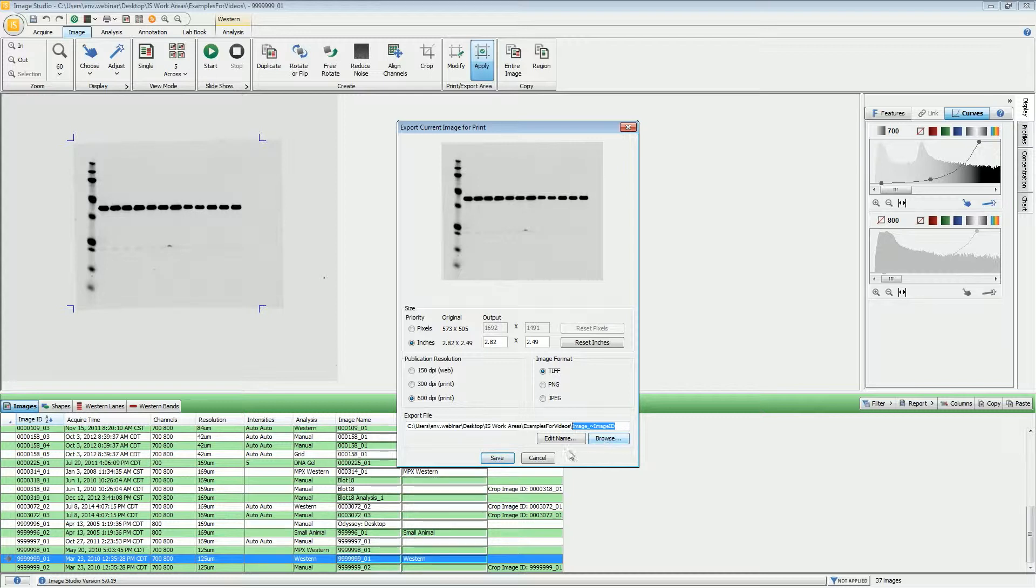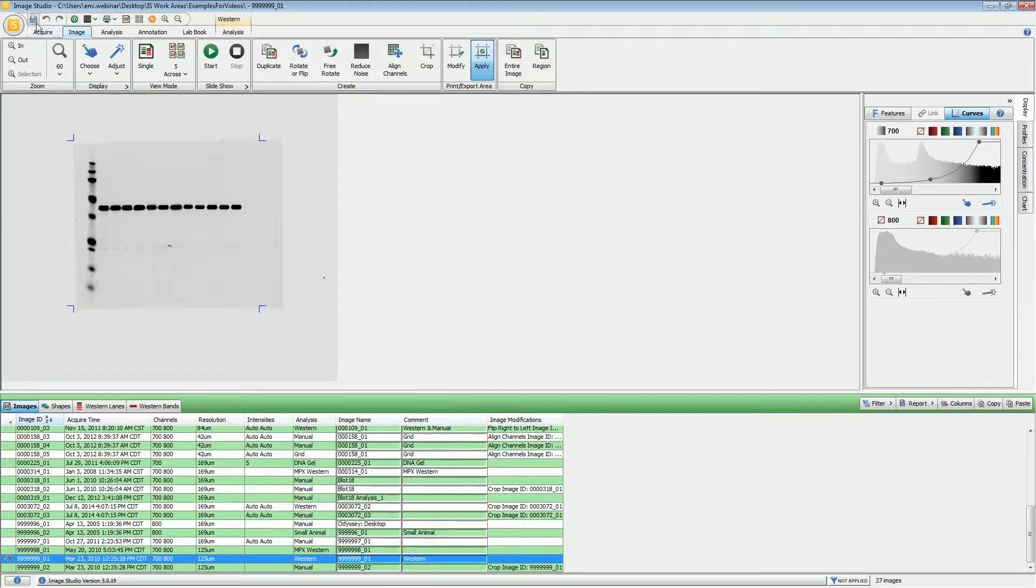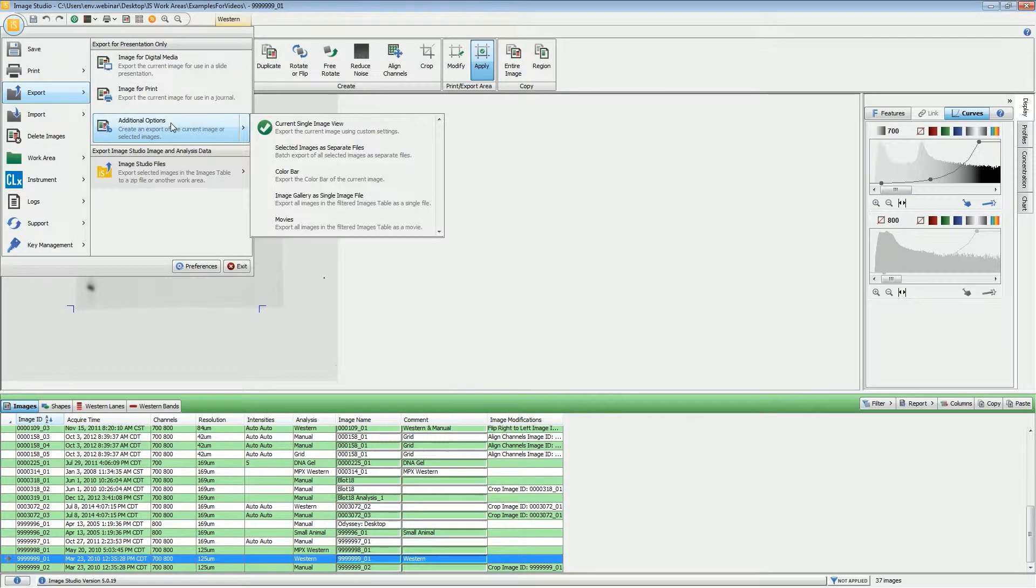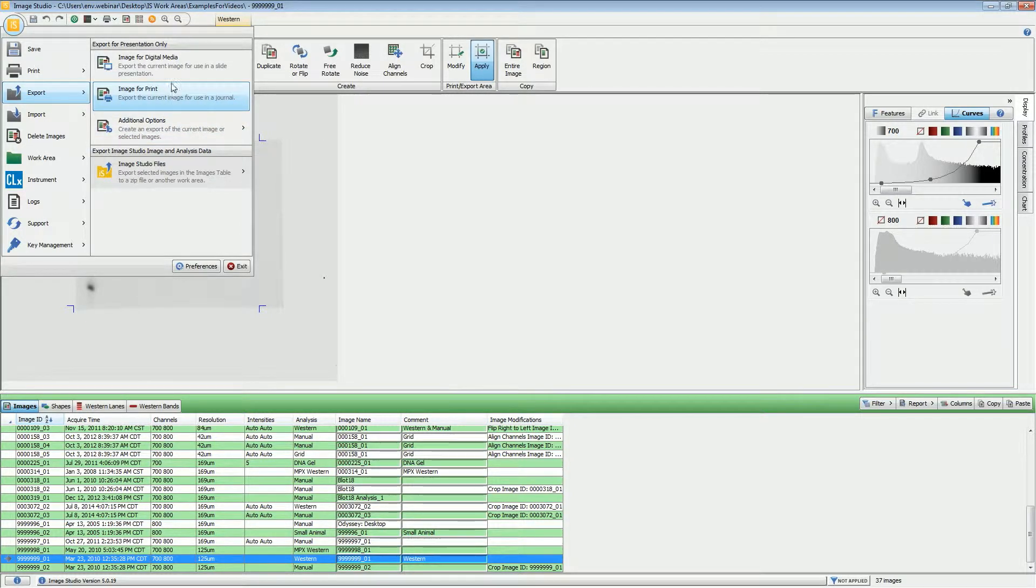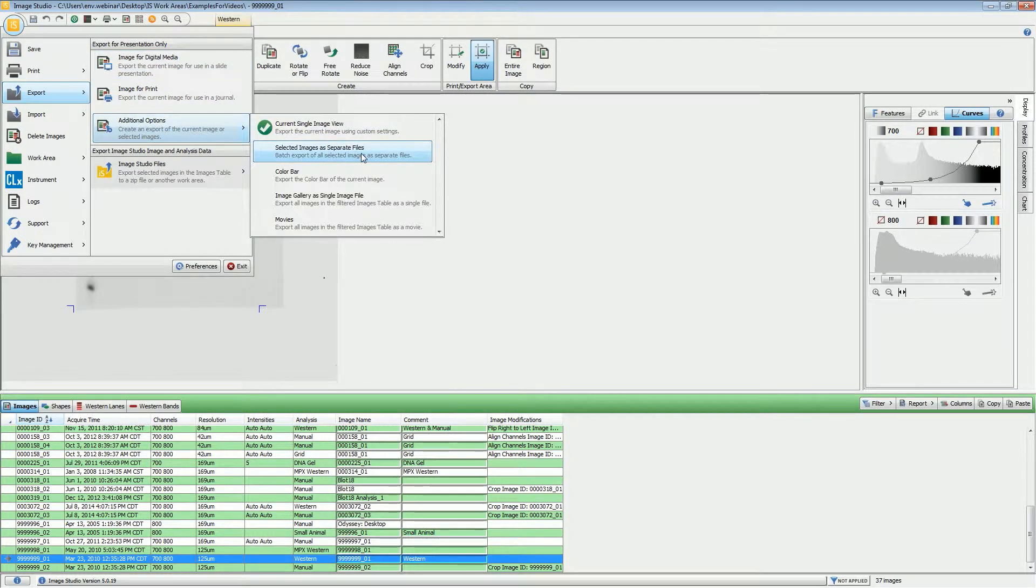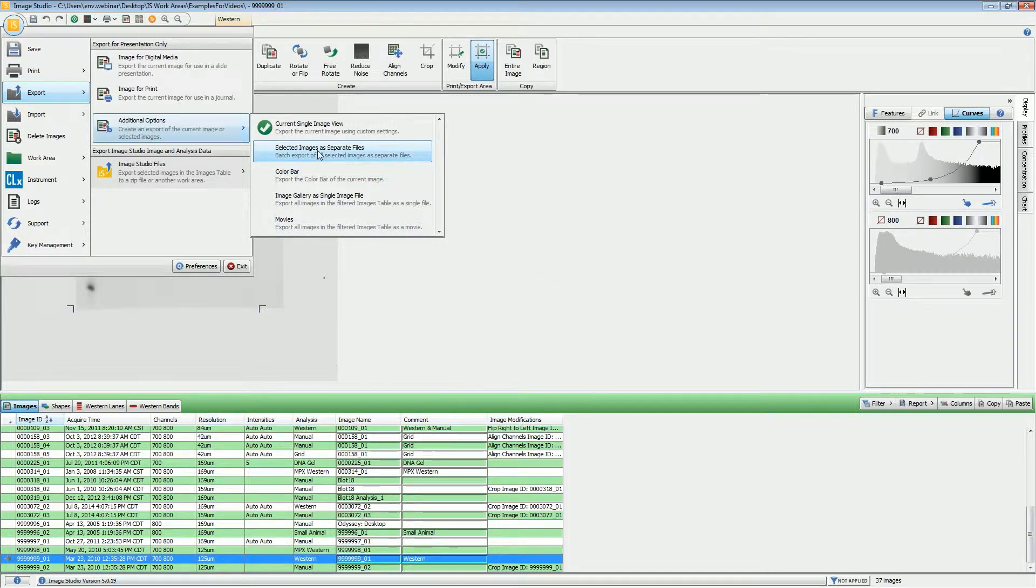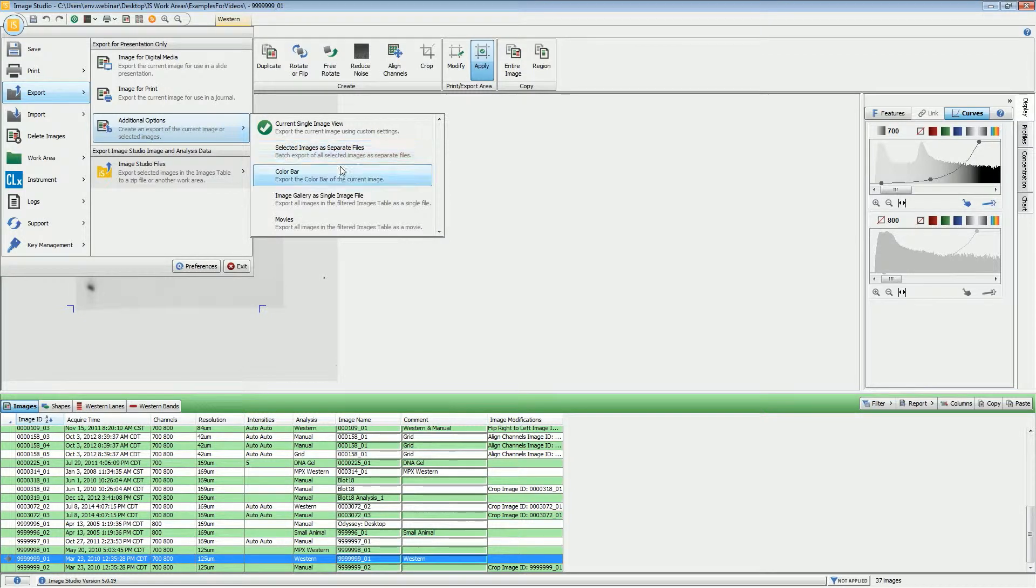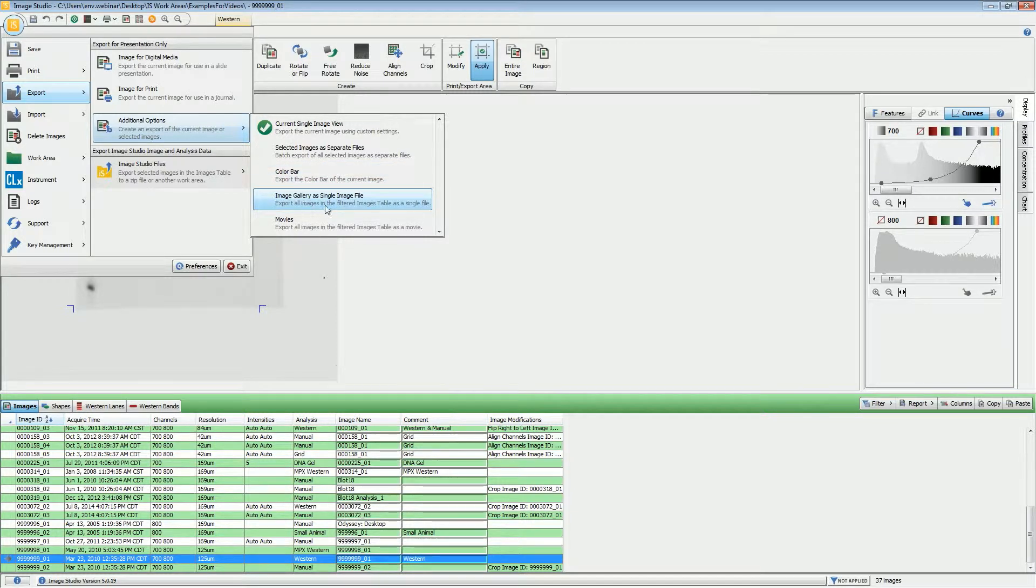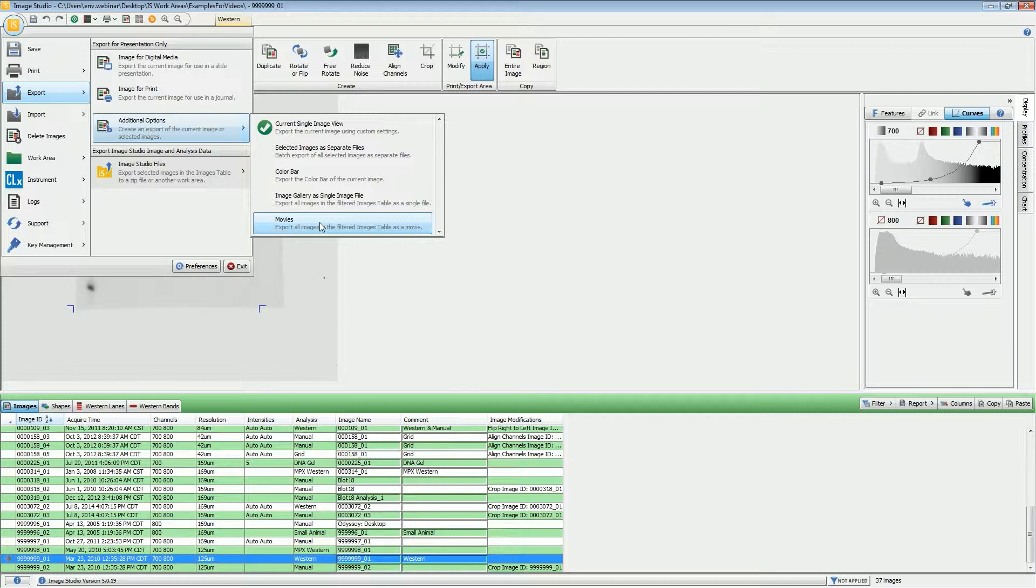Additional options: the Current Single Image View is the same as these two options right here. If you want to export a group of images into separate image files, if you have several images highlighted, you can export them into their own individual files. If you have the color bar being shown on the image, that can be exported as well. If you have several images selected, you can export them all as a single image file. Also, Movies is basically a slideshow of all of the images that you have selected, and that will send that out into a movie file.